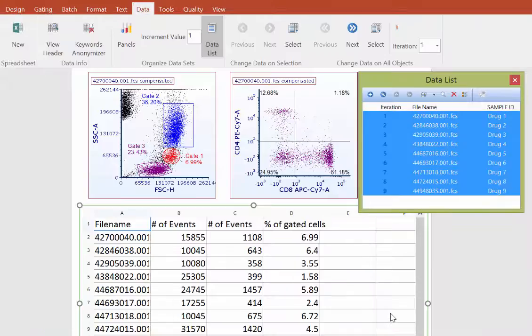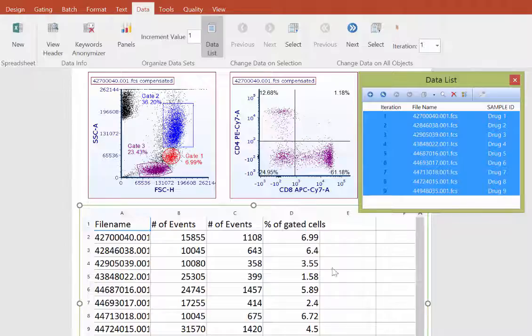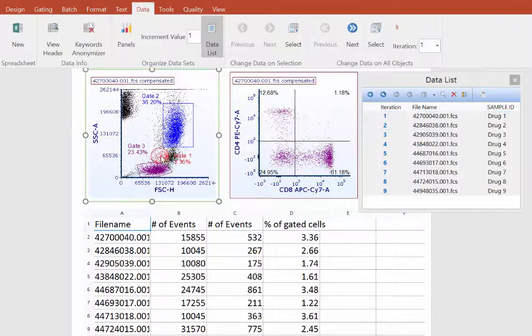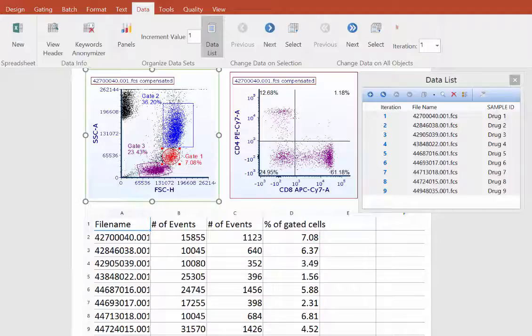the spreadsheet will be populated with this information, and as we adjust the gate, the statistics for these populations will update in real time.